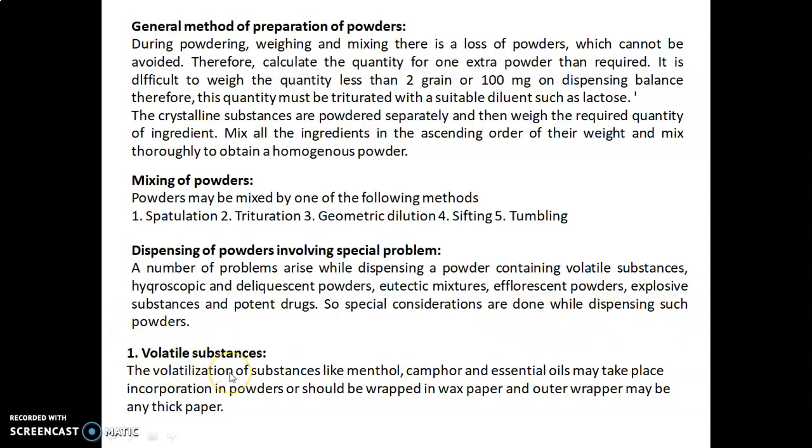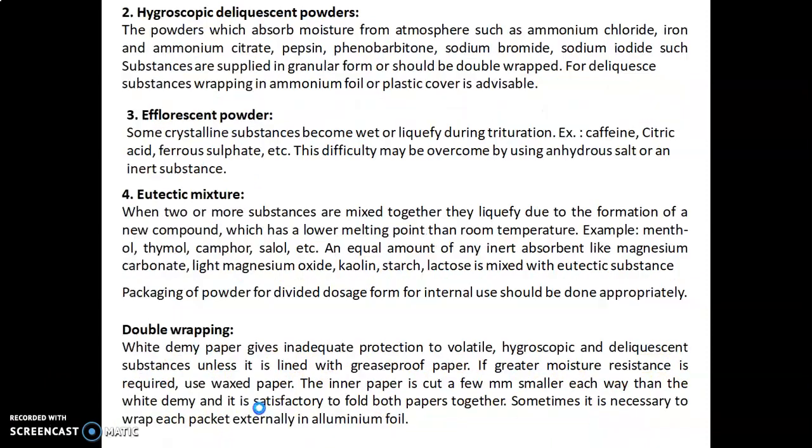Volatile substances. The first problem is for the volatile substances. The volatilization of substances like menthol, camphor and the essential oils may take place. Incorporation in the powders, or they should be wrapped in wax paper and the outer wrapper may be any thick paper.